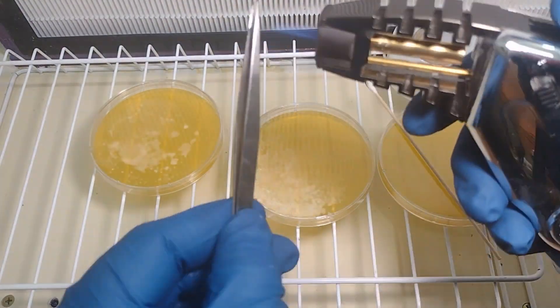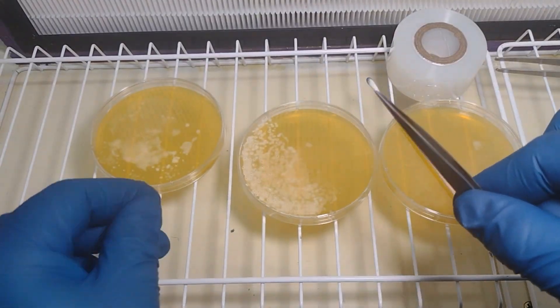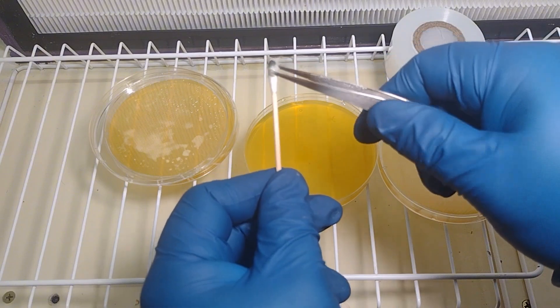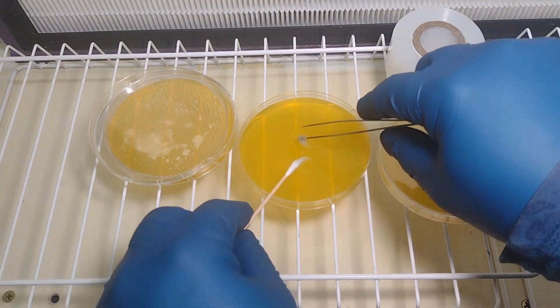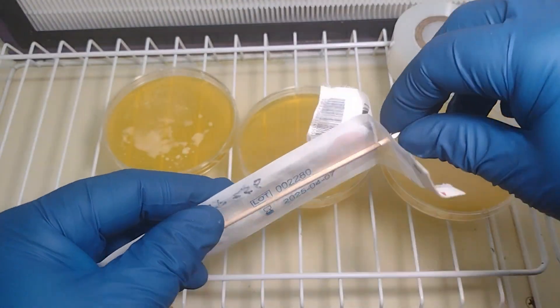For the second one, I'm going to reuse the same swab. First I'm going to sterilize these needle-nose tweezers with a torch and let it cool down for a second. Then I'm going to start picking the cotton right off the top of this swab and put it right in the center of the plate. You might have to use the swab to kind of pull it off. When we're done with that, cap it up.